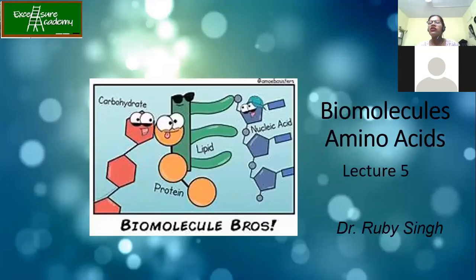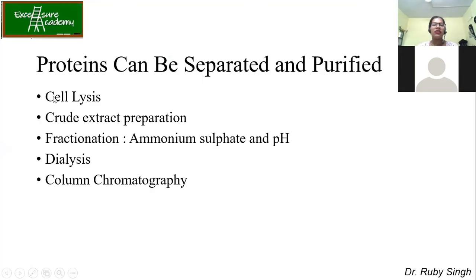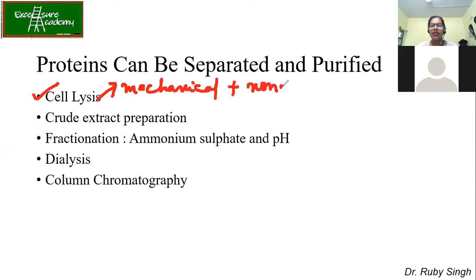Today we are going to study the steps required to carry out protein purification after cell lysis. Already we have talked about cell lysis, where we mentioned the mechanical and non-mechanical methods. If you have seen the video, you must be thorough with that. Non-mechanical means it has physical, chemical and enzymatic methods.